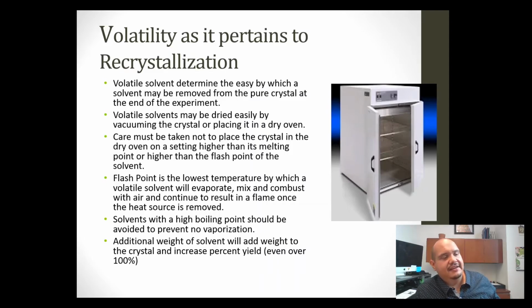It's very unlikely that your percent recovery will be anything close to 100. And if it is, it should actually be worrisome, because there is always a loss in recrystallization. There's actually an equation that you can use to calculate how much of the loss you might predict to get. This is not what we do in this lab. However, it's important to know. It's actually in the Pavia textbook if you'd like to look it up.